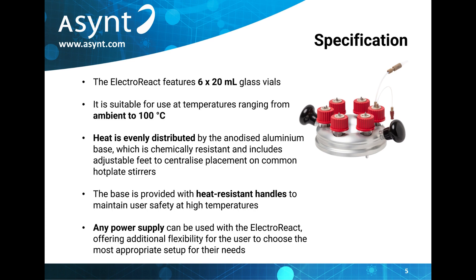The heating plate features adjustable feet to centralise the ElectroReact on any standard hot plate. These feet can be removed entirely to enable the ElectroReact to sit on irregular hot plates as well.